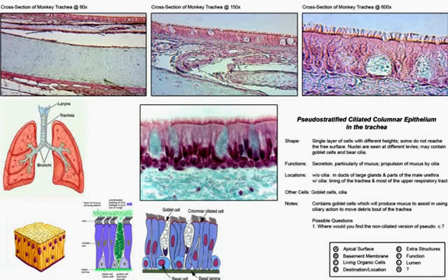This is our perichondrium. Since cartilage, hyaline cartilage, is an avascular tissue, and the chondrocytes residing in the lacunae throughout are going to need a supply of nutrients and blood gases and elimination of CO2. We would surround this hyaline cartilage with a band of dense irregular connective tissue to provide what it needs, and that's referred to here as the perichondrium of that cartilage.